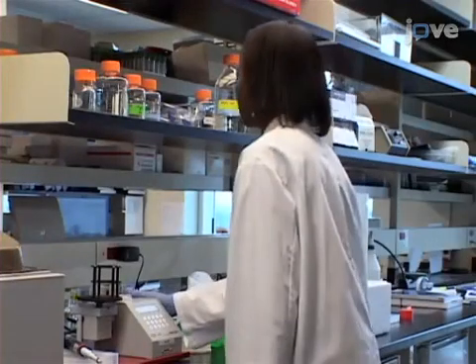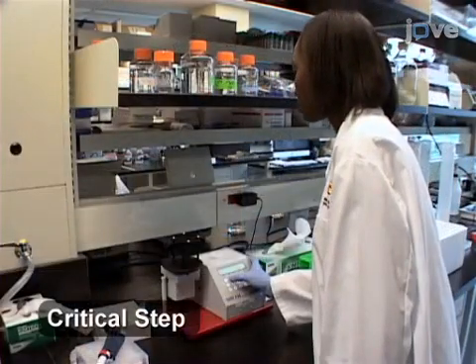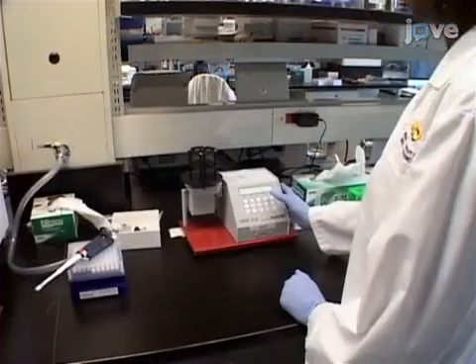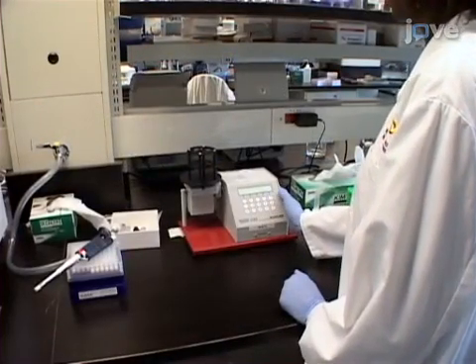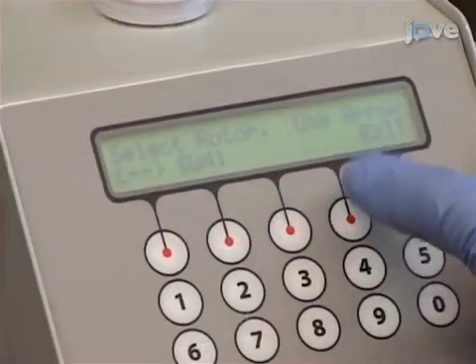To use an automated gradient maker to prepare a sucrose gradient, begin by turning the gradient maker on and level the plate that will hold the gradients. When the plate is levelled, click Done. Then, to select the gradient program, open the Grad menu and select List.